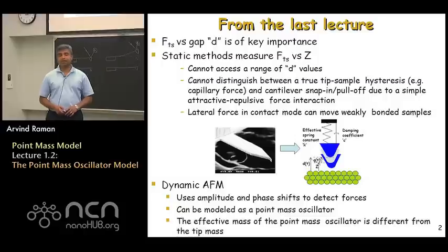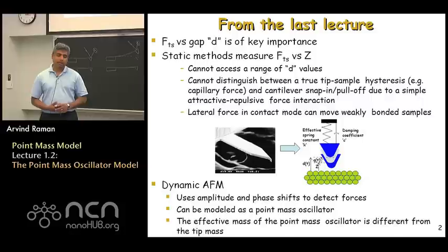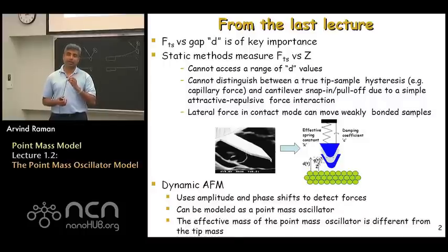In the last class, we had talked about a few key concepts introducing dynamic atomic force microscopy. The first was the fact that in AFM, we're interested in interaction forces between a few atoms on the tip of an AFM probe and a few atoms on the surface. These forces not only allow us to image samples with very high resolution, but they are of inherent interest just to understand surface physics and properties on the surface themselves.